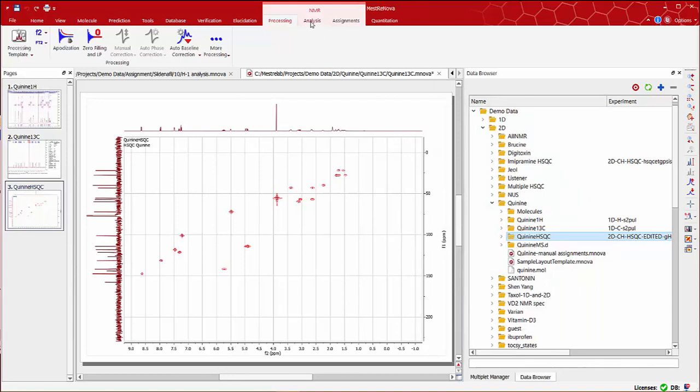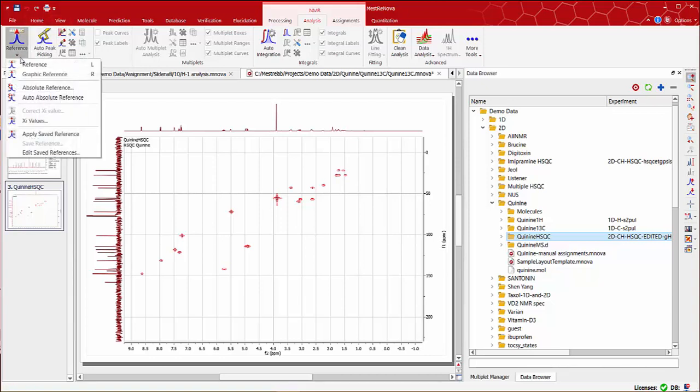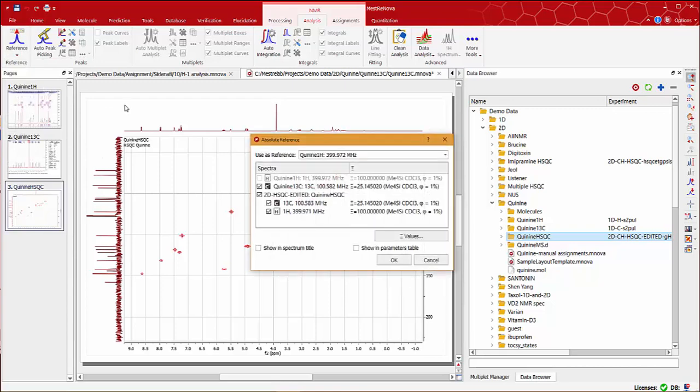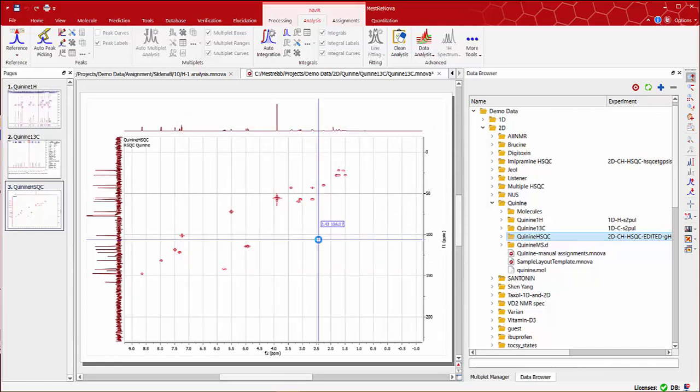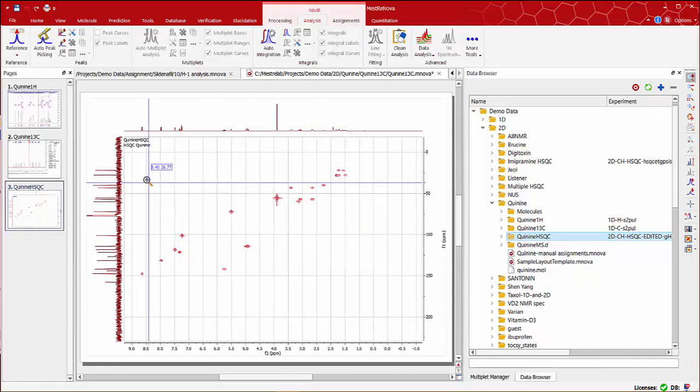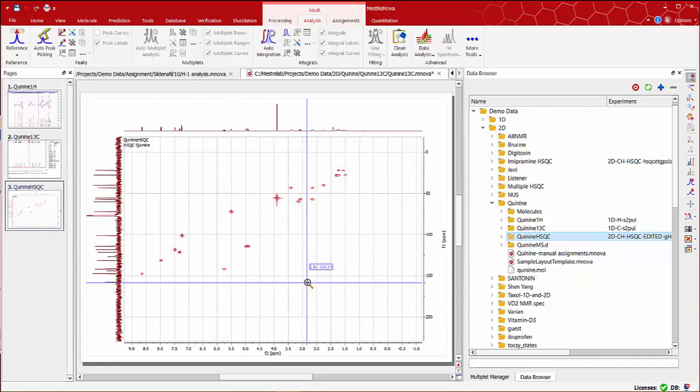Moving to the analysis tab, we should make sure that chemical shifts are properly referenced. There's a very handy tool in MNOVA called absolute reference. Select this tool on the top left-hand corner. To do this, I'm going to use the 1D spectra already processed and referenced. Click OK, and now our HSQC cross peaks are referenced with our 1D traces.